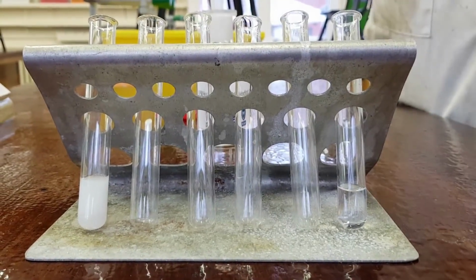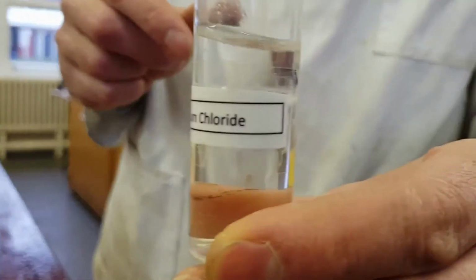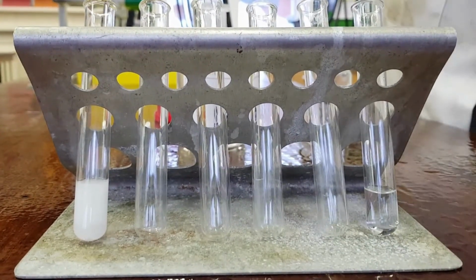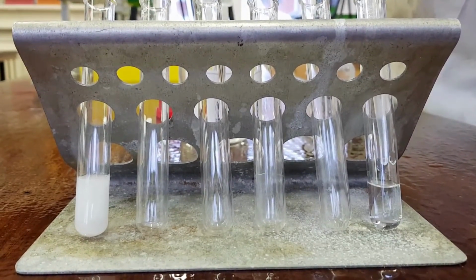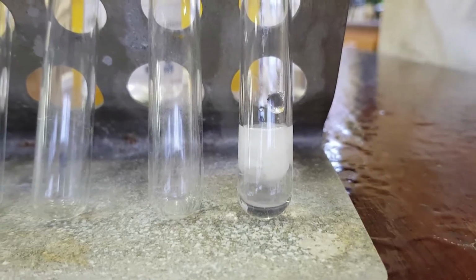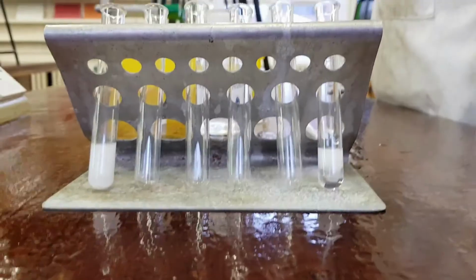So we're adding some hydrochloric acid simply to remove any impurities, and then the important reagent is barium chloride. And again, we only need to add a few drops of this. We can do this with very small quantities, and as the barium chloride is added to the sulfate solution, we end up with a lovely white precipitate that is diagnostic of a sulfate solution.